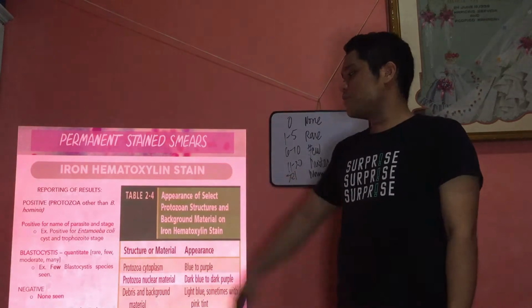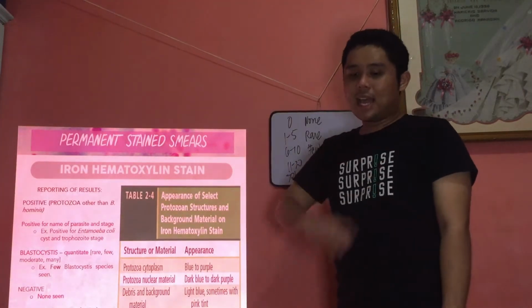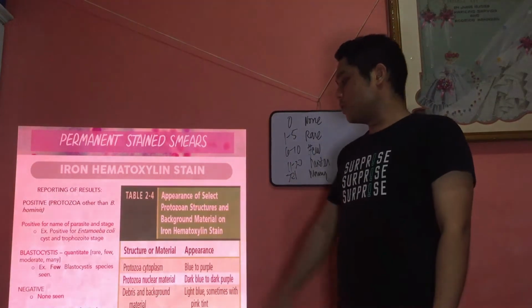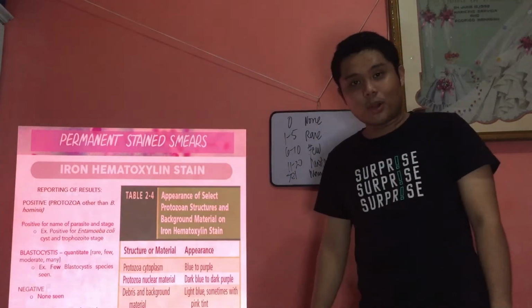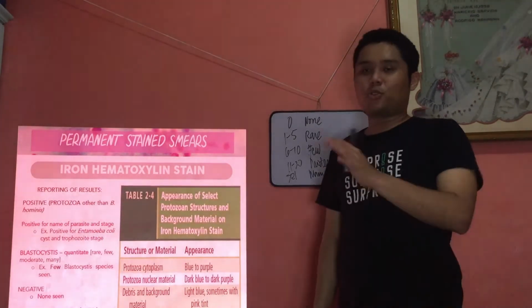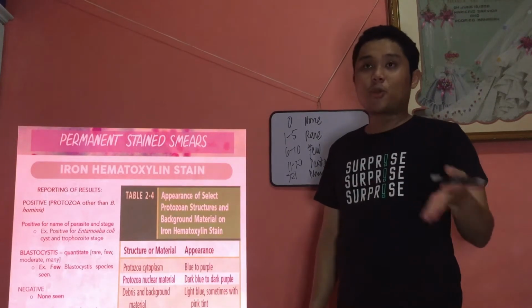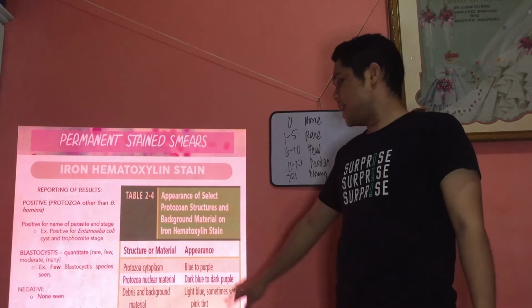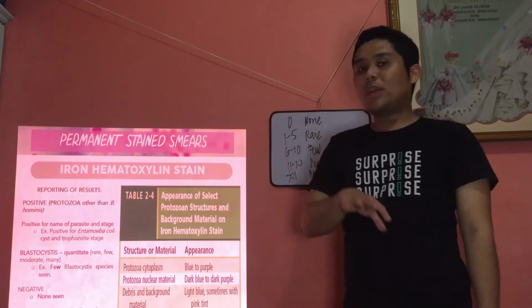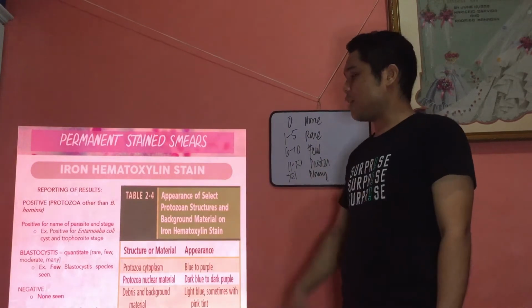Okay. And negative, none seen. Okay. And the manner of reporting is also the same as trichrome staining in our last video. Okay. And for the appearance, protozoa cytoplasm is blue to purple. Okay. The protozoa nuclear material is dark blue to dark purple. So it's different from your Wheatley's trichrome, di ba? The nuclear material in Wheatley's trichrome is red to purple, di ba? And the background material is light blue, sometimes with pink tint. Whereas for Wheatley's trichrome, the background is green. Okay, di ba? So that's for iron hematoxylin.